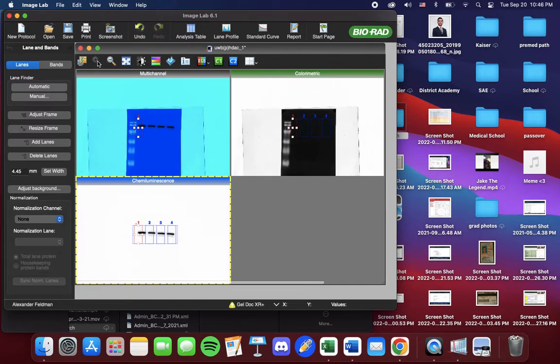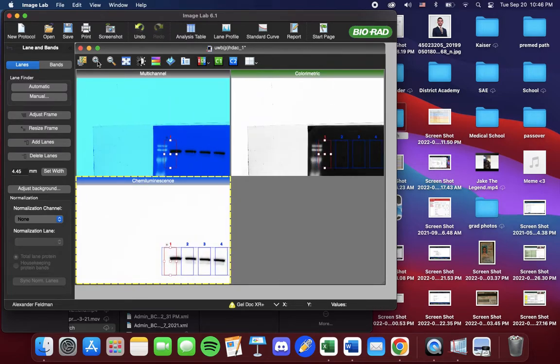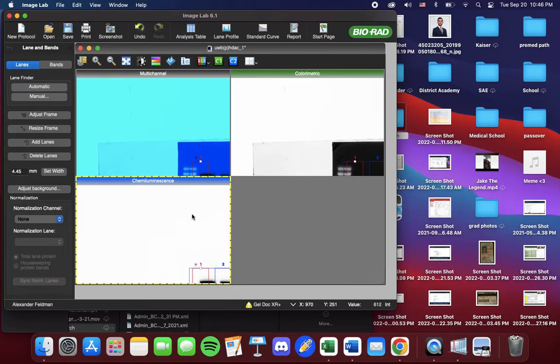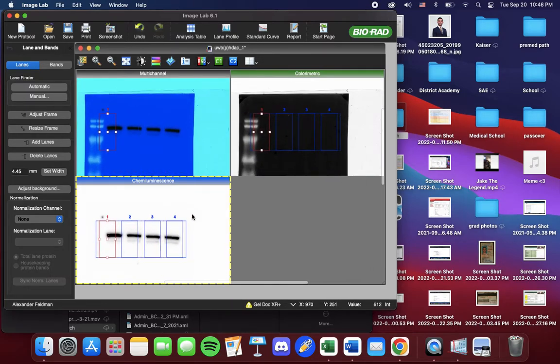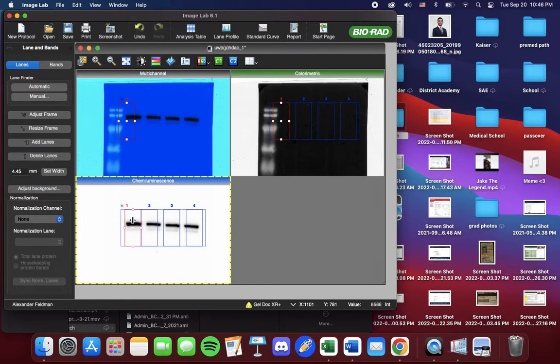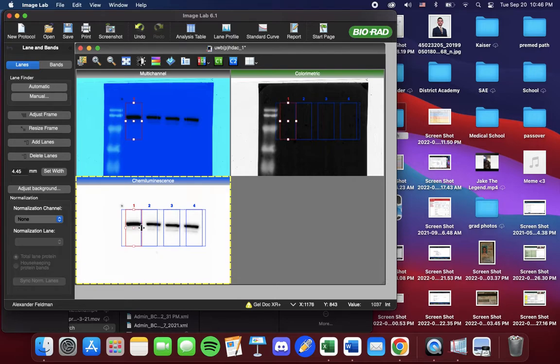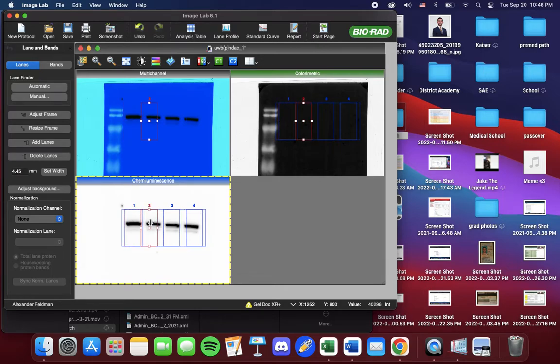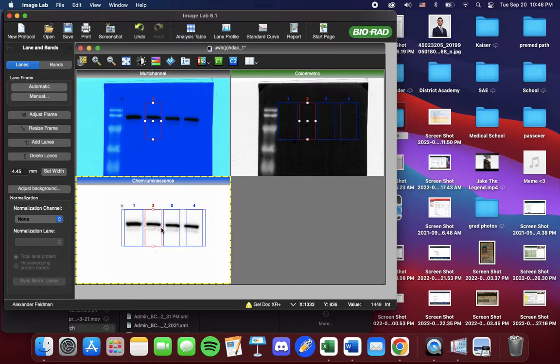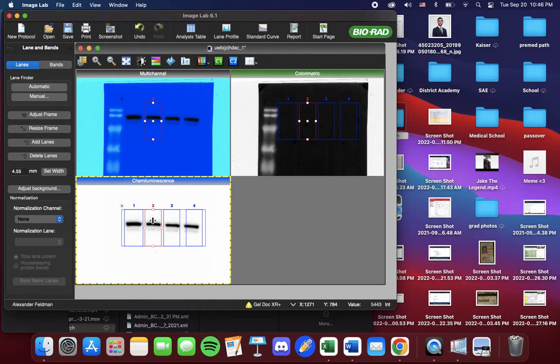We're going to zoom in and center using the scroll wheel. And now we can manipulate the lanes in order to include the entirety of the band. It's a little tricky. You have to select the center if you want to move it.